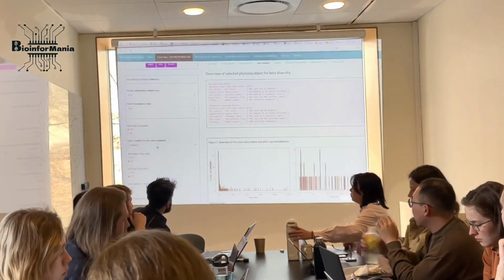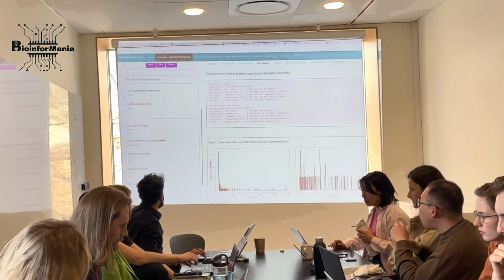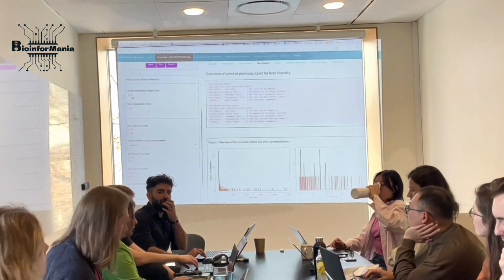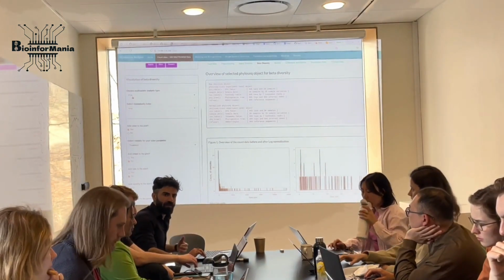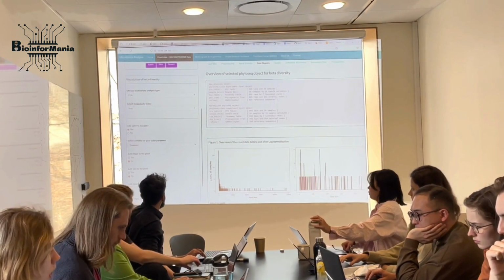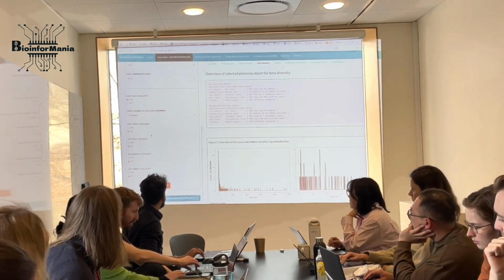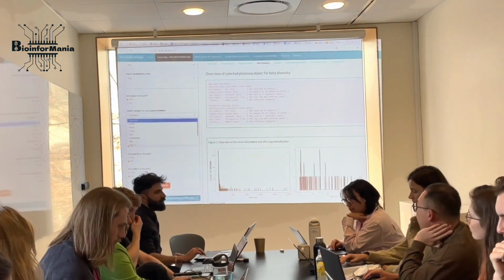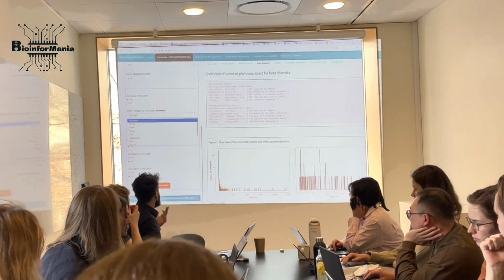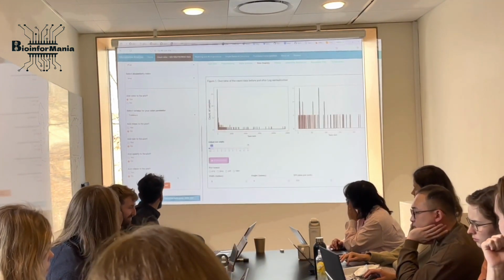Once you've done your transformation and normalization of your data, you can visualize it. Just do a principal component analysis on your raw data. You will ignore this when you are on PCA and then just proceed, because automatically it takes the first column of your data. But luckily it happened to be the treatment of my interest.